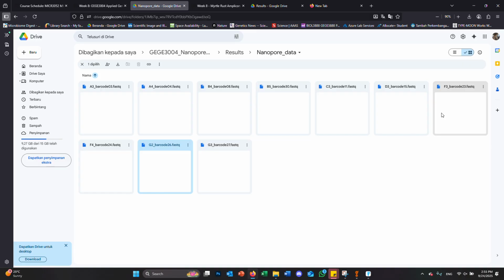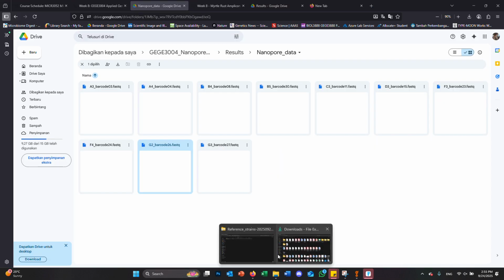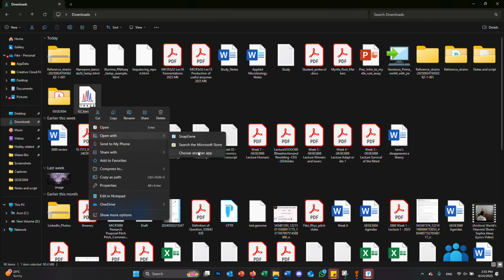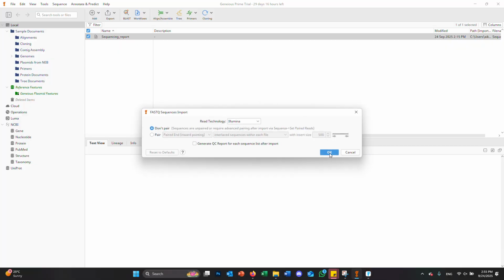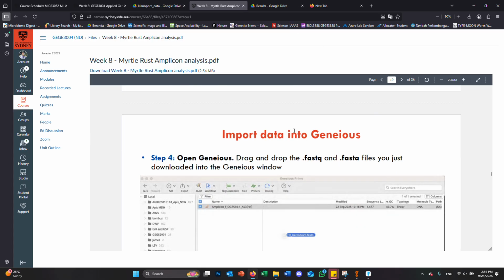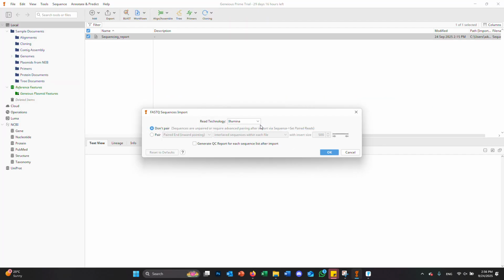Then you need to choose the mapper. Minimap2 would be the one. Now, why do we use Minimap2 and not something else? Minimap2 is specifically designed for long reads. It's a new piece of analysis software that many people are using for nanopore sequencing. We use other short read mappers like BWA when the reads are short. This has some algorithm tweaks that mean it can handle long read mapping, probably some different gap penalties and error settings, so that the parameters suit the nanopore data set.